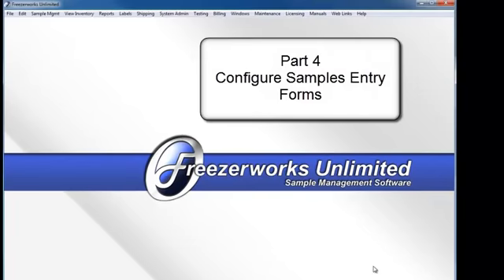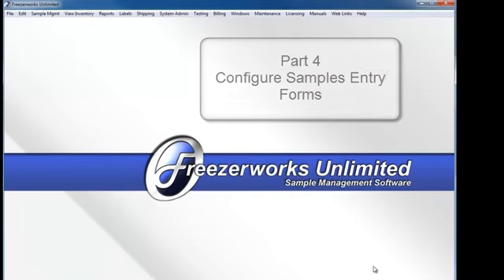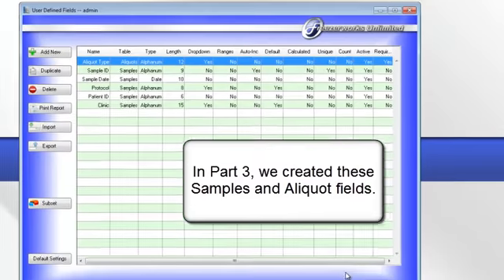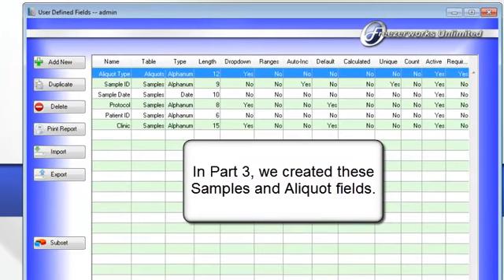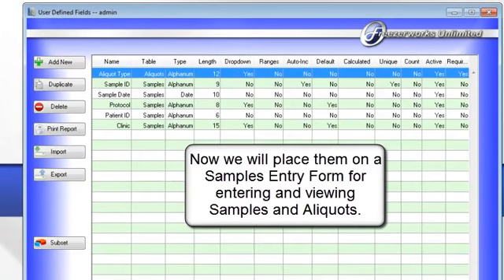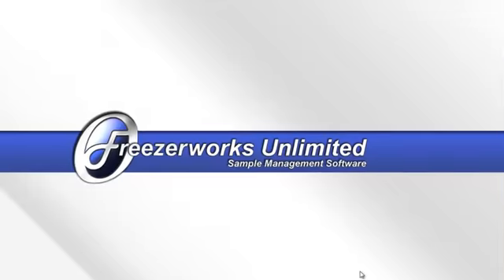Part 4. Configure Samples Entry Forms. In Part 3, we created these samples and aliquot fields. Now we will place them on the Sample Entries form for entering and viewing samples and aliquots.